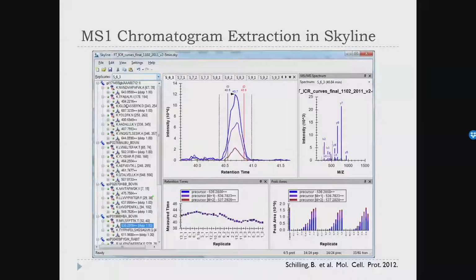Yeah, so there's two things, right? As soon as it gets high enough, it becomes the highest peak that the mass spectrometer can see. So it goes, boom, and I'm going to take an MS spectrum. And actually, the paradox of faster mass spectrometers is that they will take that first spectrum closer to the baseline, because they're always looking for something. And then there's some dynamic exclusion.